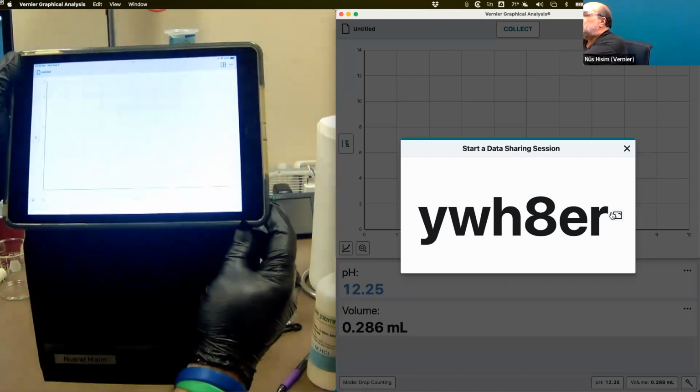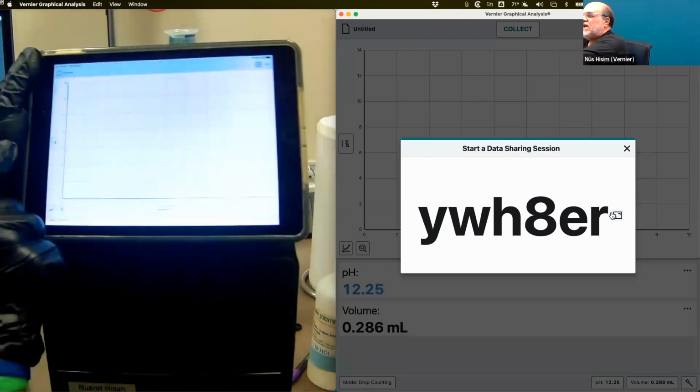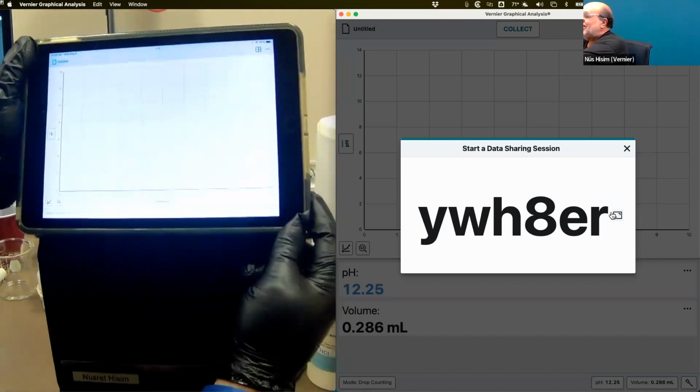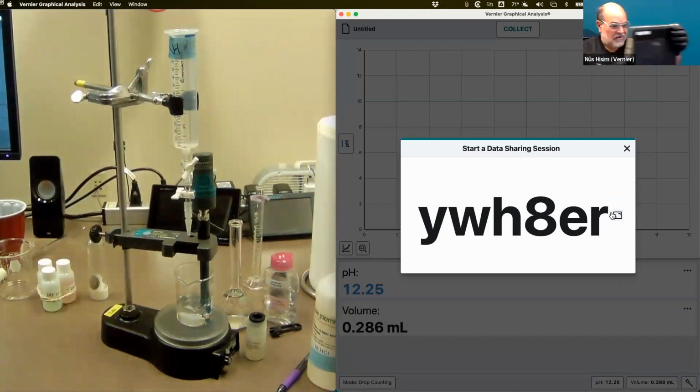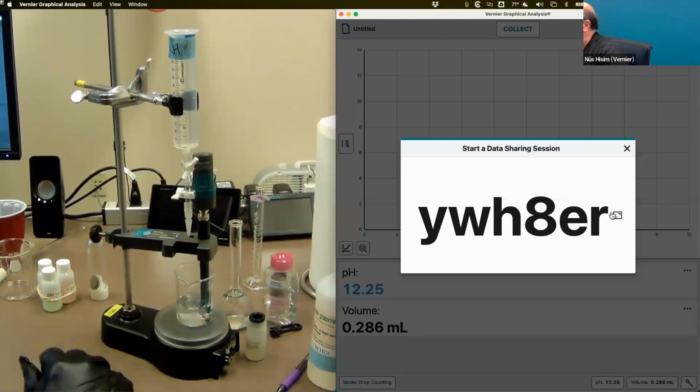You might notice, it's hard to tell on my iPad, but if you just did it, my iPad now says pH and volume. So it's kind of ready to collect the data. So get that in there. And if you need help, tag Melissa and she'll walk you through getting it connected.